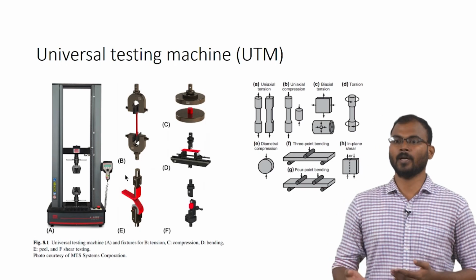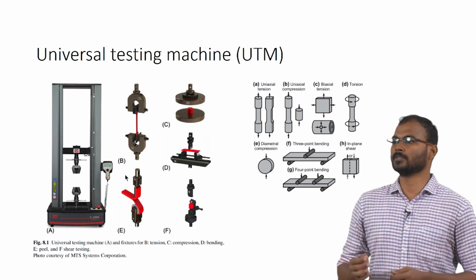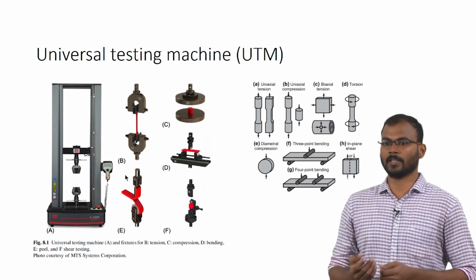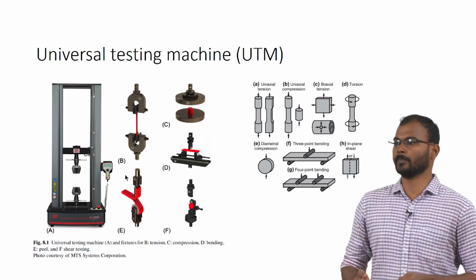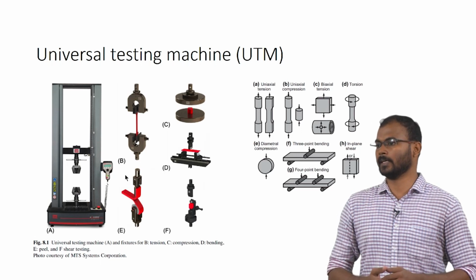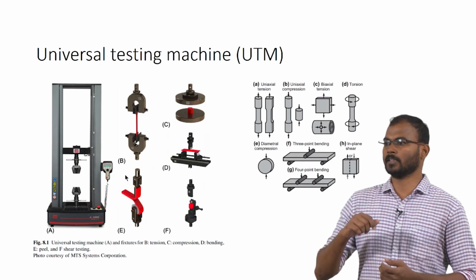If you are having screw plates in the legs and this prosthesis, there the bending would be different based on how many screws and nuts you are introducing into the plates. Based on that you can go for 3-point bending or 4-point bending to exactly characterize how that will function inside the biological system. Then torsion, where a twisting occurs on the sample.